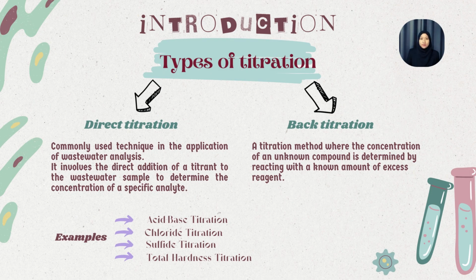There are two types of titration, which are known as direct titration and back titration. But we will discuss more further about direct titration because it is related to the topic of this presentation, which is the application of wastewater analysis.